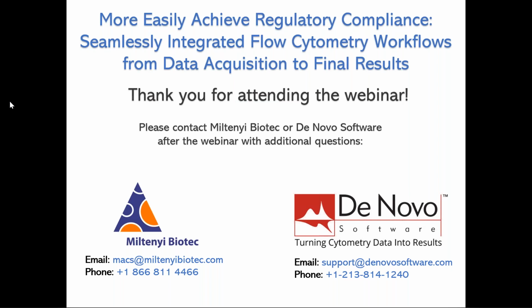Here's another question that came in about file compatibility, and actually there were a few of these that came in, and one was about FCS Express. Can it read the MQD files and the FCS files? Can it read the MQD files automatically? Can you convert MQD files into FCS files within FCS Express itself? So just a few of the questions, and I thought I'd have a little discussion around that. What FCS Express will do is, if you've created the MQD files, we'll just load them directly.